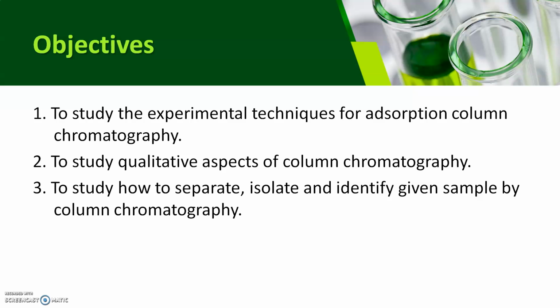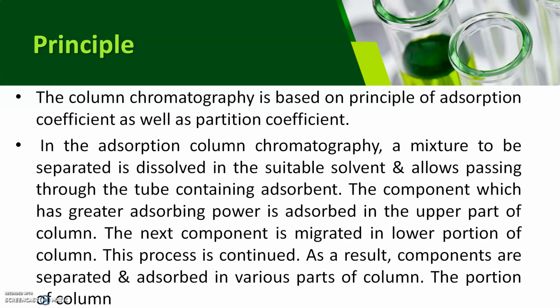Then we'll move towards the objective. The objective of the experiment is, first, to understand the experimental technique for adsorption column chromatography. Second is to study the qualitative aspect of column chromatography. Third is to study how to separate, isolate and identify a given sample by column chromatography.